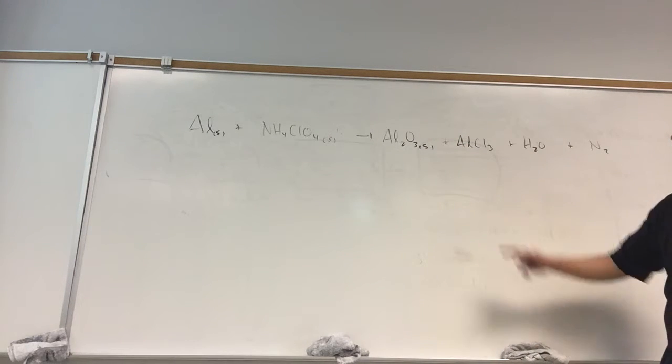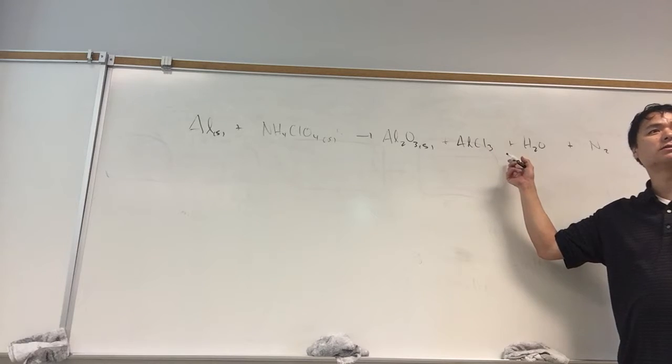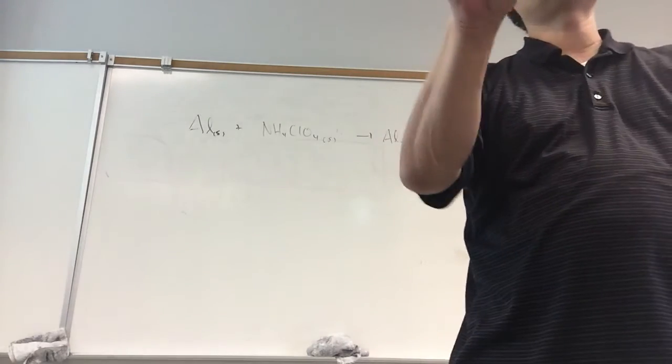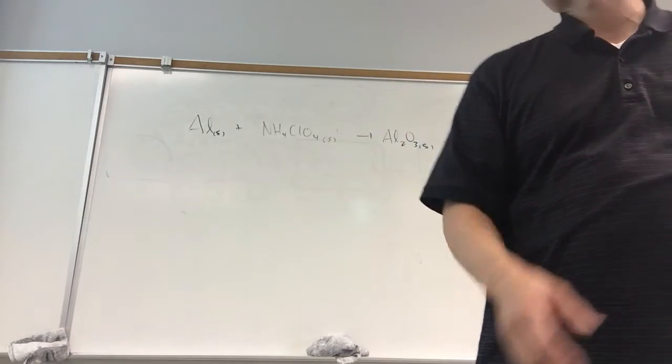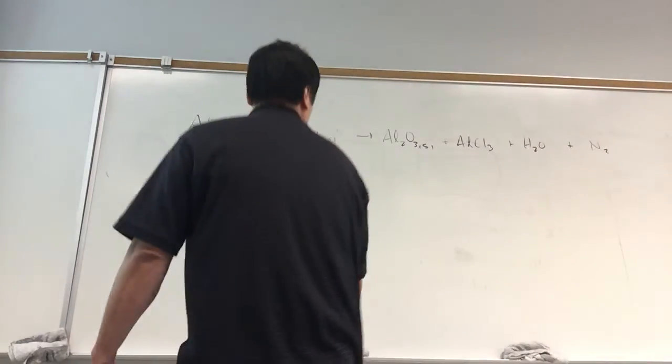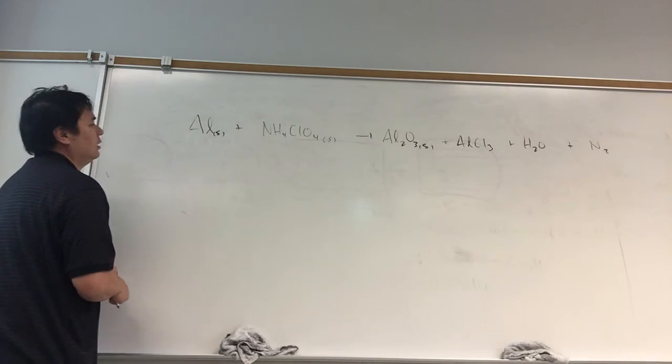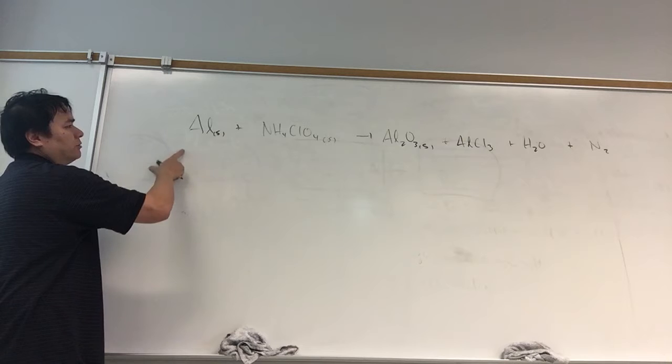Now, would this have been easy to predict, these products? No. And so that's what's often done in redox reactions. You mix it together and you see what happens. So this is the case here. We mix this together, see what happens. Well, we're going to get a lot of energy. This is rocket fuel, basically, solid rocket fuel.